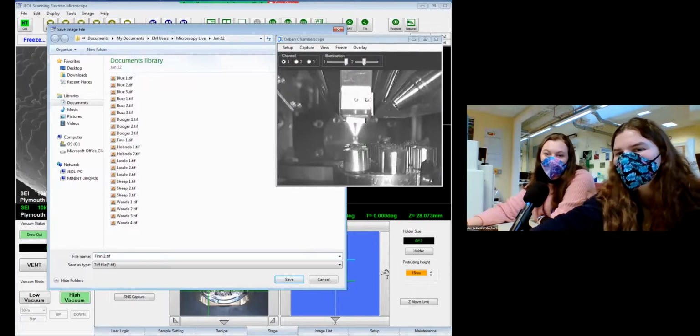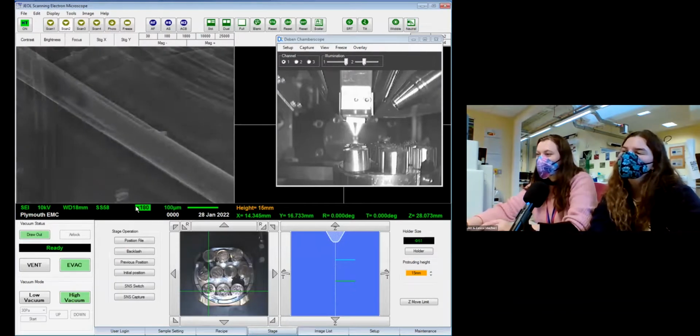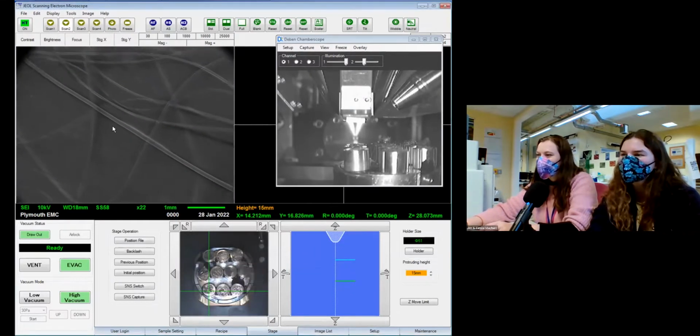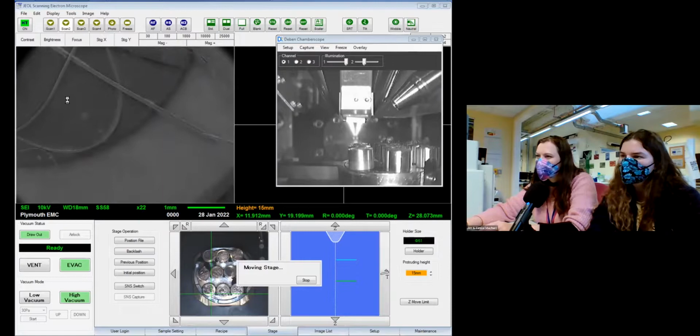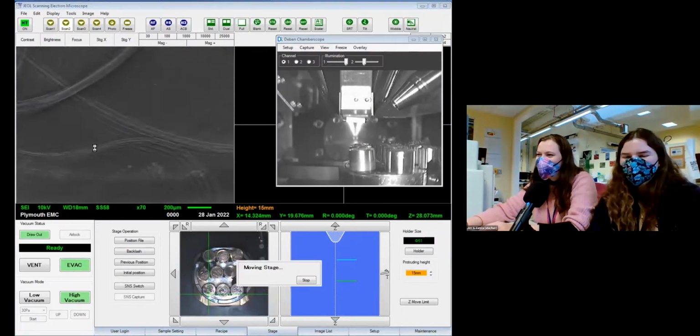Yeah, so the outer coat looks like a bark effect and the softer undercoat looks like a leaf. Yeah, I get that. Definitely. It seems to be a consistent thing across dogs as well, which is quite nice. It looks like there's a really thin... Yeah, I was pointing at the screen, but you can't. You got to the right bit.